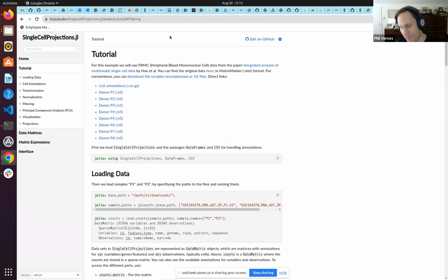So like I said, you need 3 tabs open to do this, but because you can stop me and ask questions, it'll be manageable. If you go to the GitHub, you'll find a link to the tutorial. I am using the data sets from this tutorial. I just use the cell annotations, right? So those are the annotations that I spoke about here.